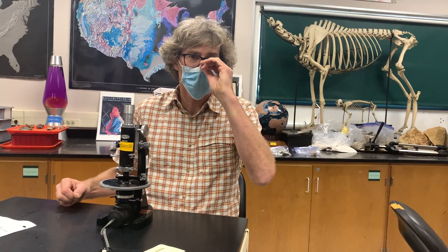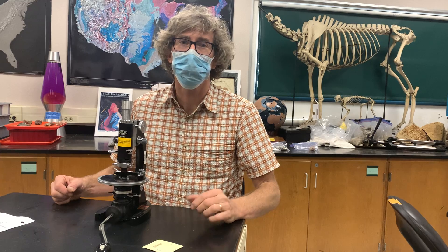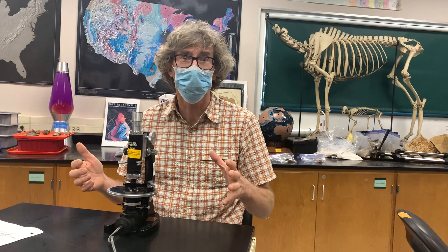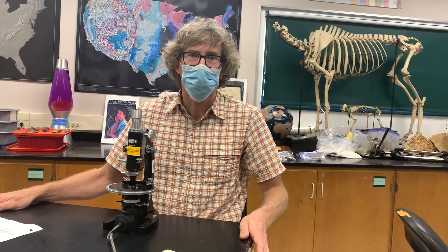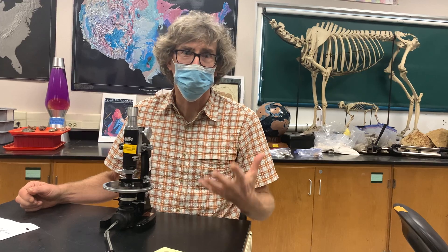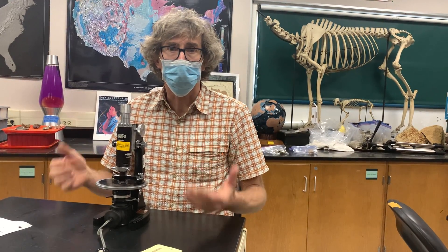Welcome to what's going to be a load of fun. It might be a little difficult because I won't be here to really help you one-on-one, hands-on so much. We're going to treat this last third of the lab as anything we can get out of this, which definitely will be something awesome. My expectations that you guys are going to master all these techniques aren't going to be as high, but you're going to be fascinated by what these microscopes are able to reveal about minerals in rocks.